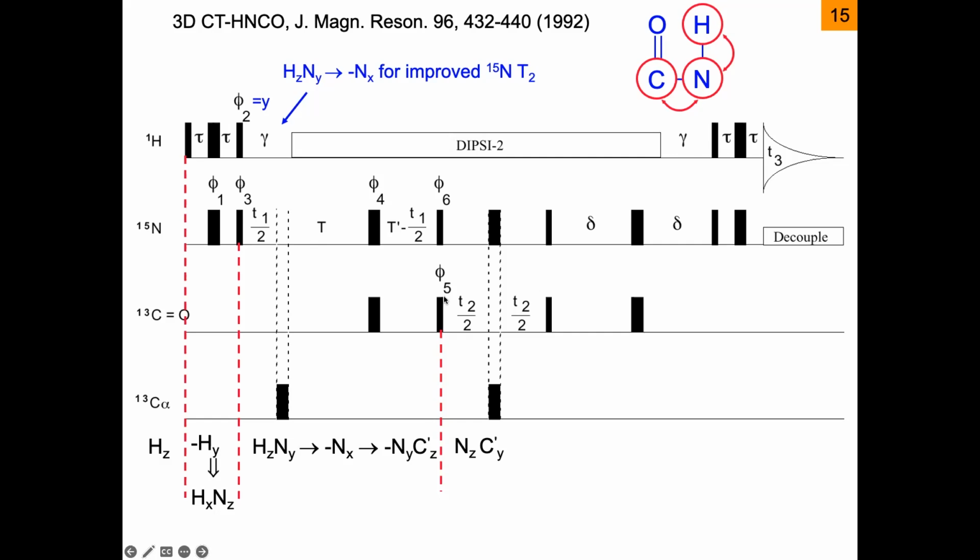We start at Z, and then you get minus carbonyl Y magnetization. So if you do the signs right, I think it's more or less like this here. And so then you have transferred to the carbonyl, and on the carbonyl, you can then evolve the chemical shift. Let the carbonyl rotate and increment this evolution time t2.